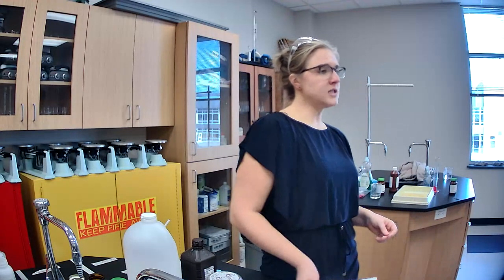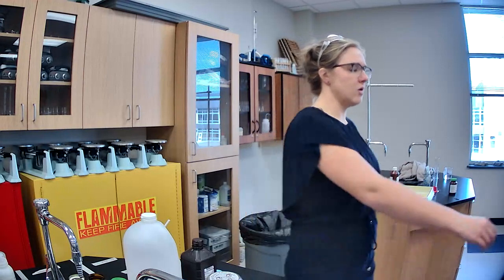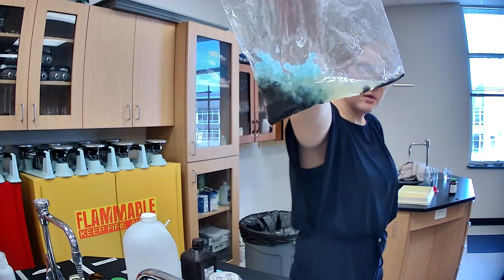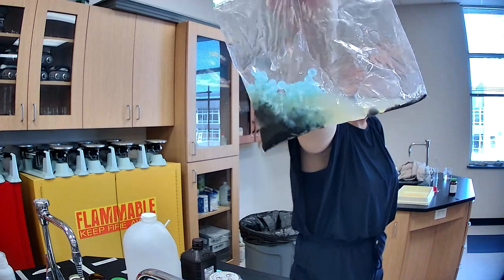I guess you could try it, but I don't know why it wouldn't work. Maybe if you had just a pure iron metal or a pure iron nail. I don't really know. Let me hold it up so you can see that color over here.